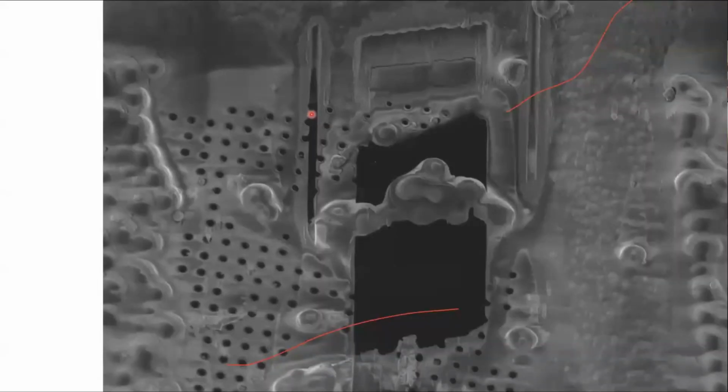In multiple views and multiple angle views, you can see the differences. This is one of the first lamellae we have prepared. We could say that the first lamella was prepared in cryo condition using the yeast system. So later we can produce many others.